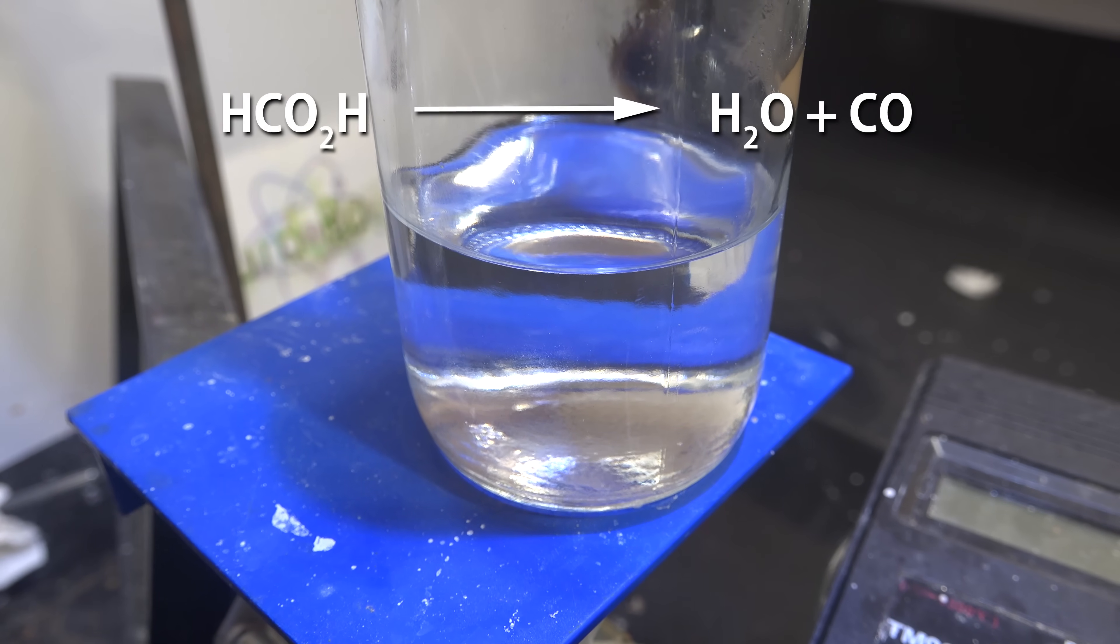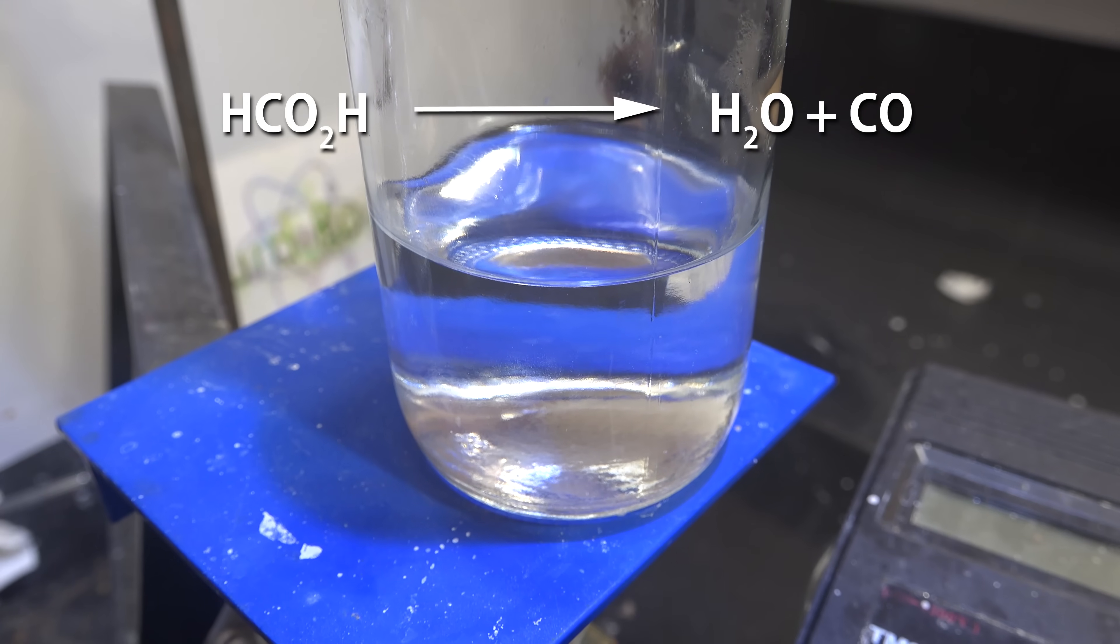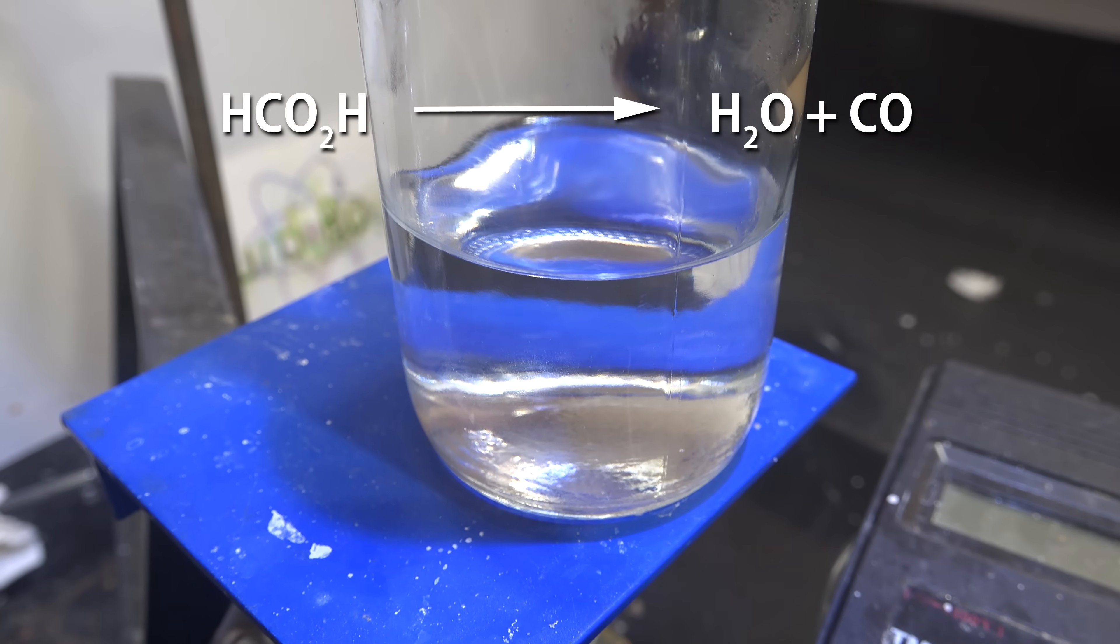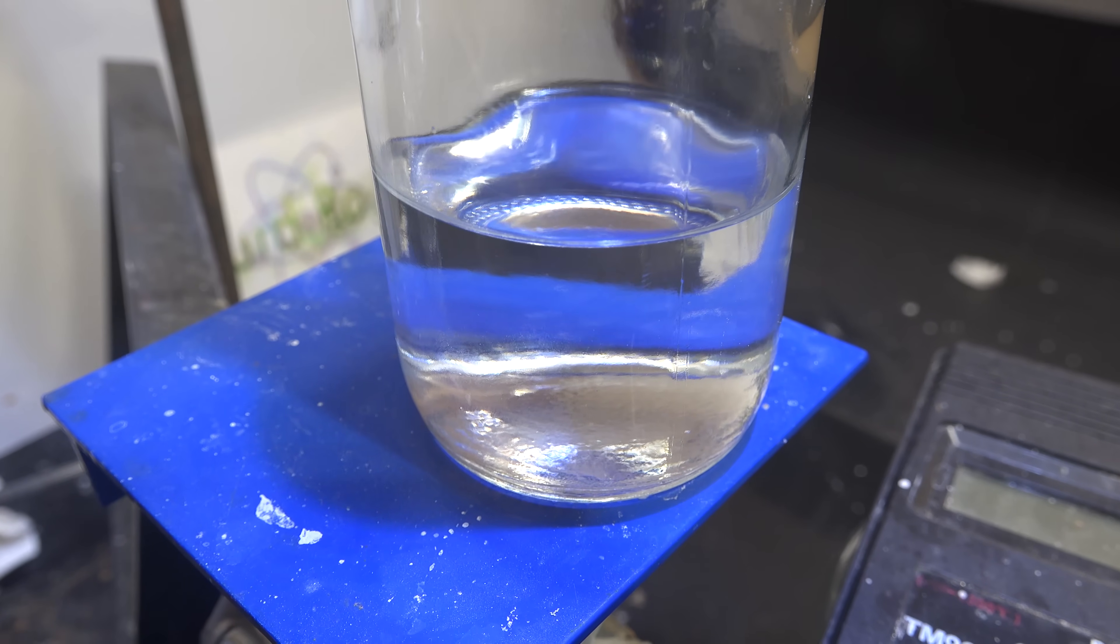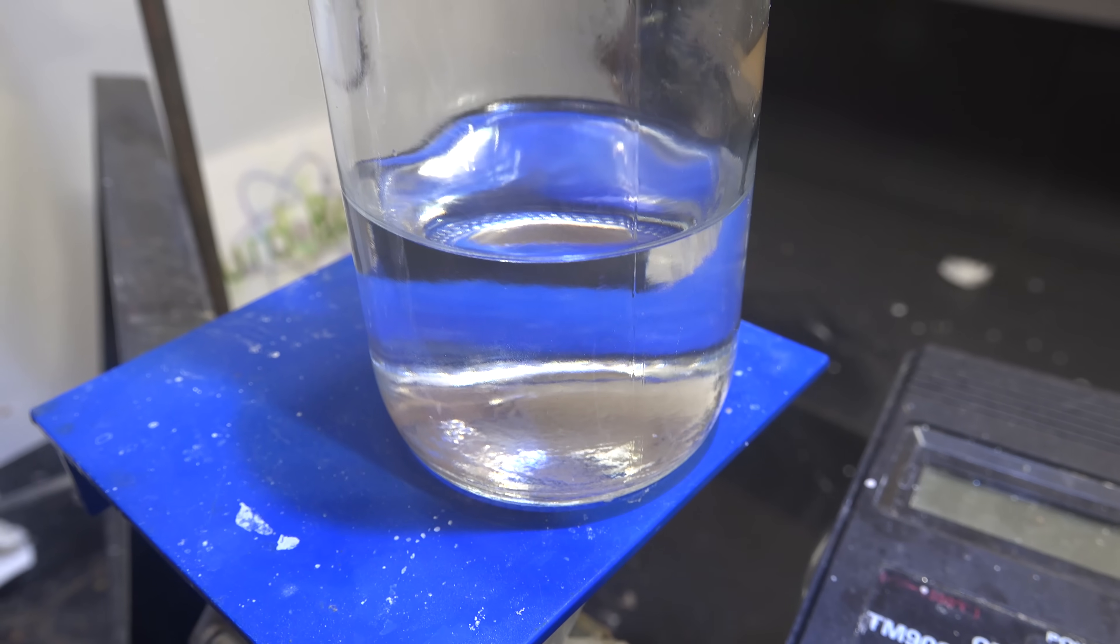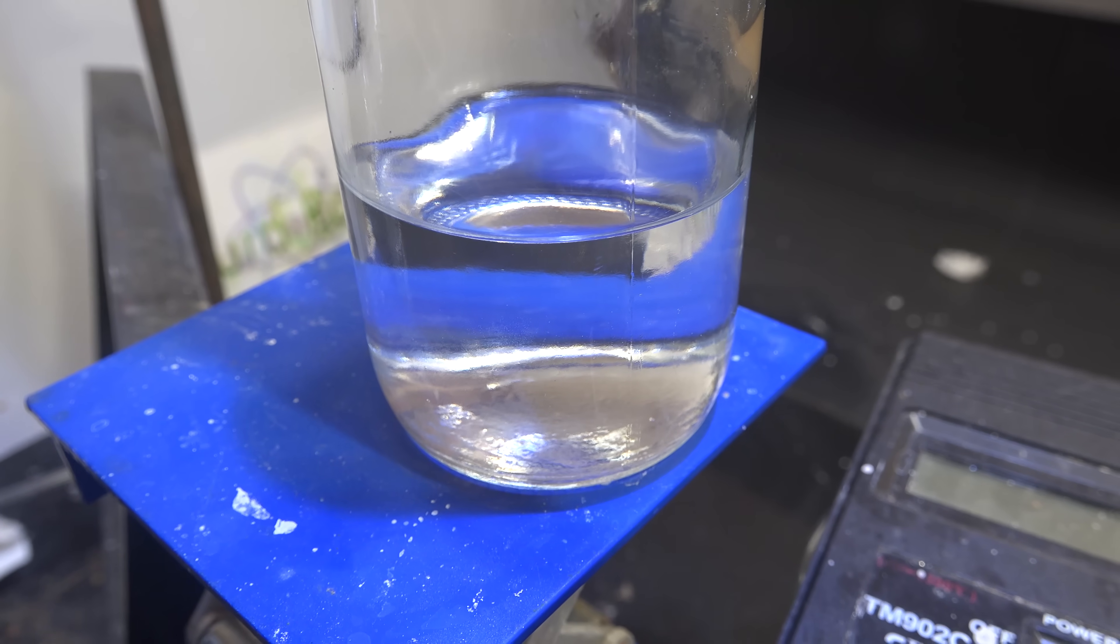Formic acid has a tendency to generate small amounts of carbon monoxide when you attempt to dehydrate it. Especially if you use sulfuric acid as a dehydrating agent. I thus recommend storing it and using it as the azeotrope. For most amateur uses some water isn't a problem anyway.